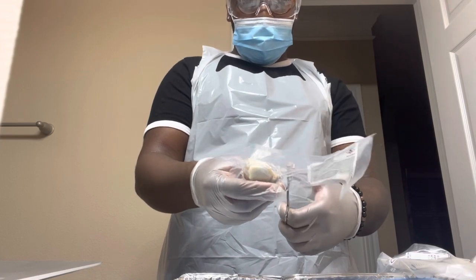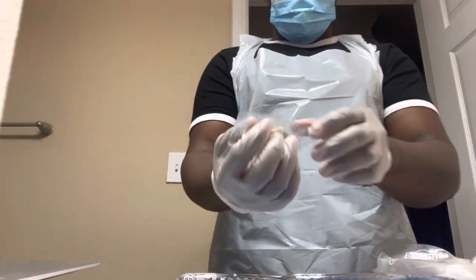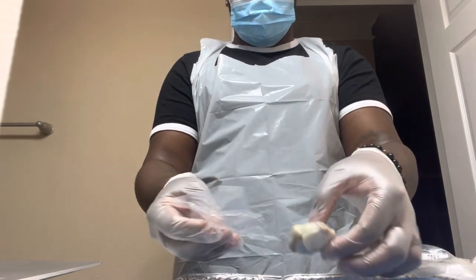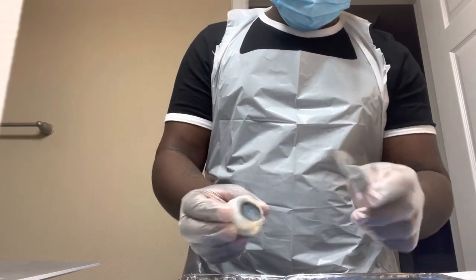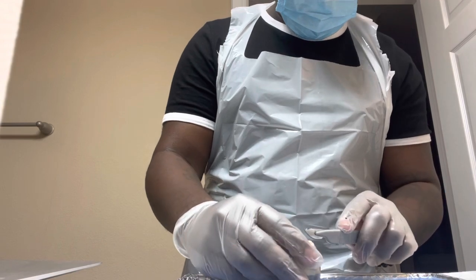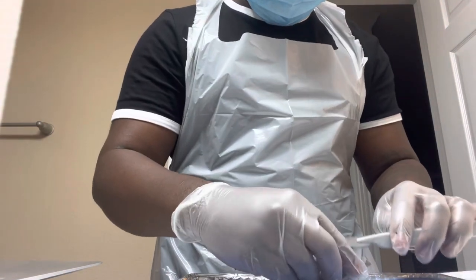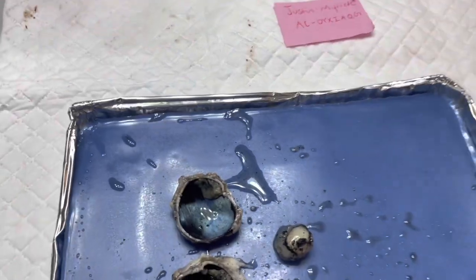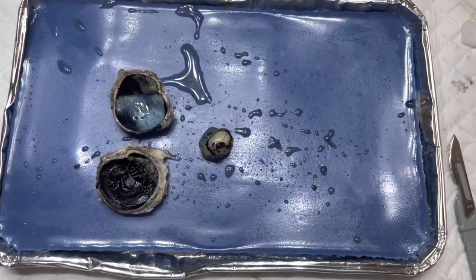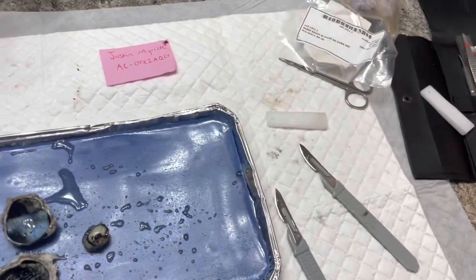All it says on the picture is to dissect it and cut it open. Oh my God. Supposed to remove the lens of the eye. I'm assuming that's this. How do I get it out? Oh, I don't know. But we're just gonna make our first cut. It's juicy in there. Maybe I need my other knife to really get the job done. In case you're wondering, this is what the cow eye looks like after dissecting the lens. And I don't know what that other piece is, but yeah. I don't know what I'm doing, but you know, we're making things shape. We're making things move.